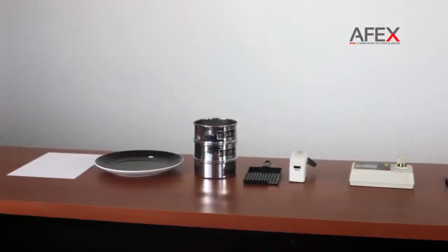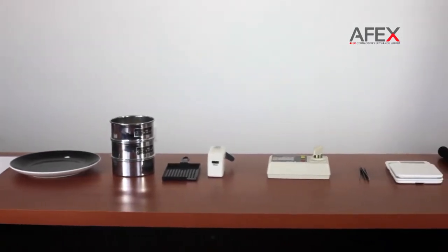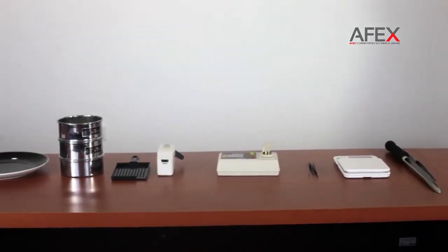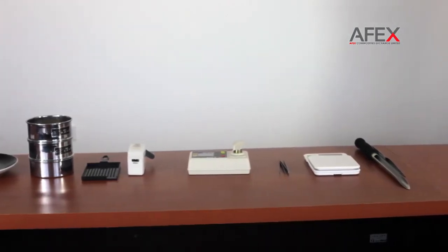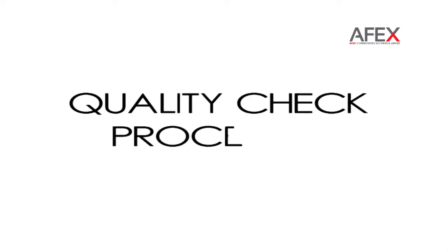There are tools for quality checking. All of the tools are mobile. We will now show the procedure of the quality checking.